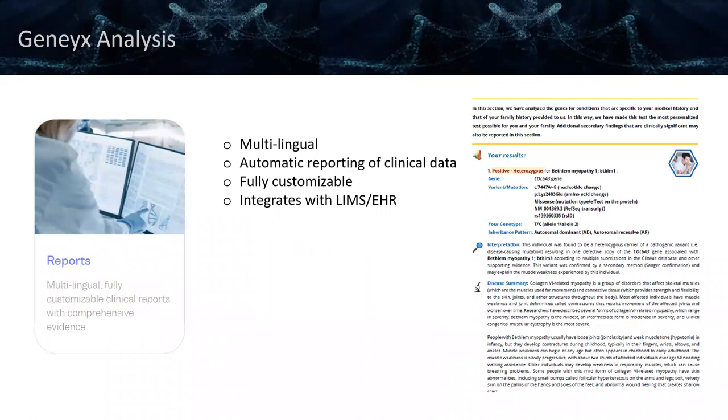And lastly is our reports. A lot of diagnostic and clinical labs will tend to use different third-party reporting capabilities. And so Geneyx Analysis is really a complete clinical solution. We do offer reports.